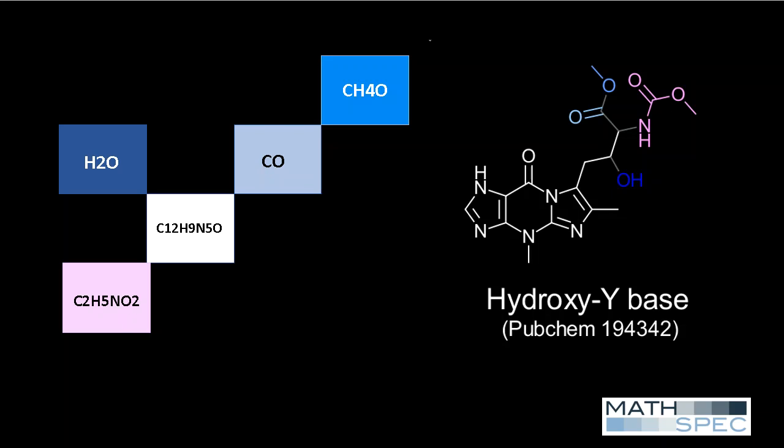So it appears that this compound called hydroxywybutosine actually seems to work really well with the modular structures. Number 2 that we had, it's almost a perfect fit. It was found in wastewater treatment plant A.